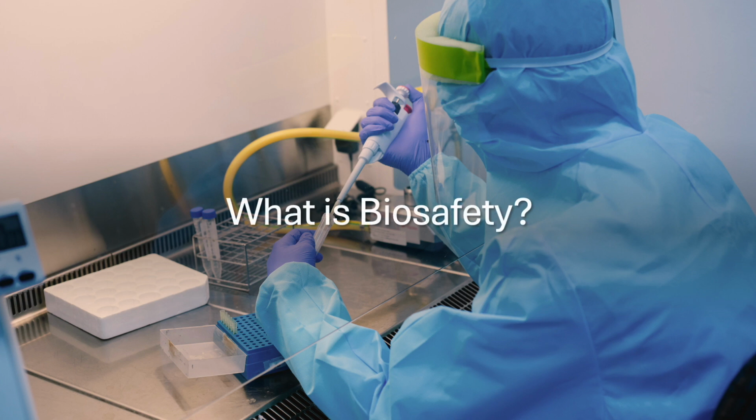Biosafety refers to the set of principles, practices, and safety measures implemented to prevent accidental exposure or release of infectious agents, toxins, and other biological hazards in laboratory and research settings. It involves the use of specific protocols, safety equipment, training, and specially designed facilities to protect laboratory workers, the community, and the environment from potential risks associated with handling biological materials.